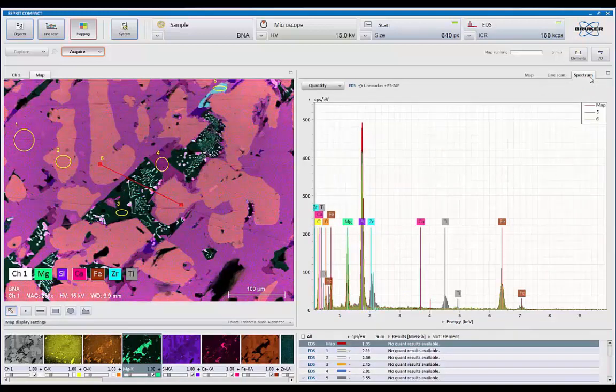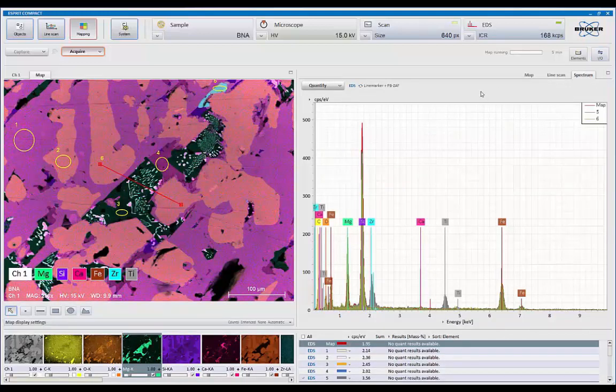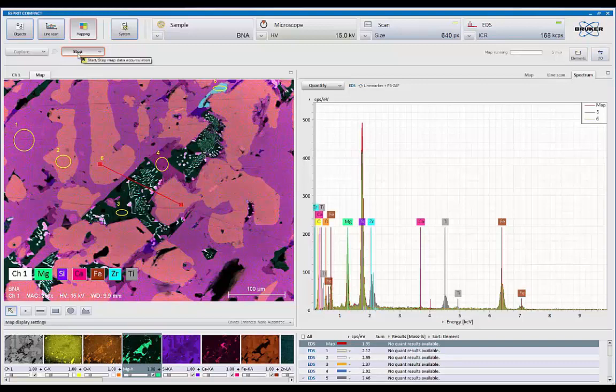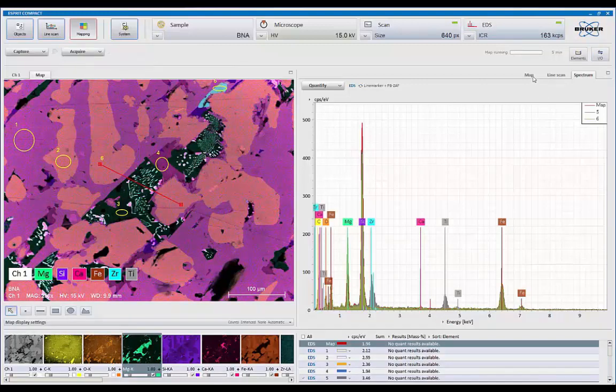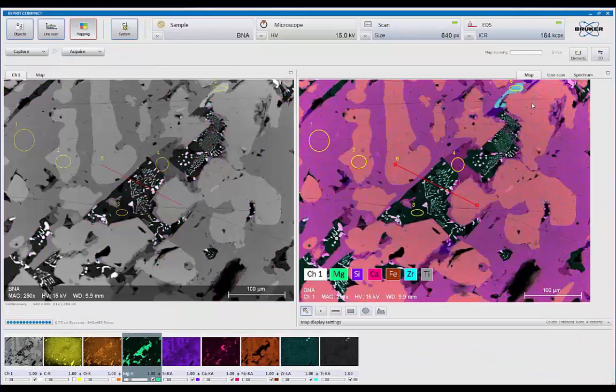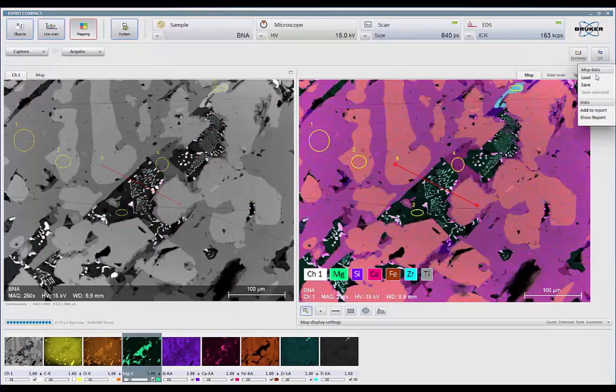And there's my data coming in nicely. Once I'm satisfied with my results, I can stop the analysis. It'll finish the frame automatically. And now, again, I can put this all into a report simply by saying add to report.